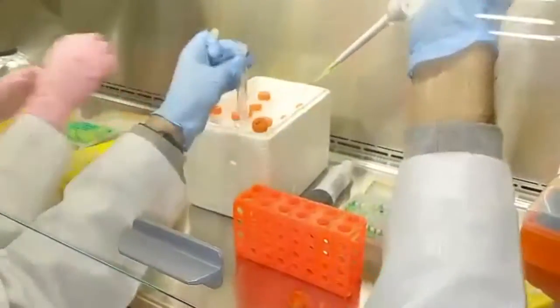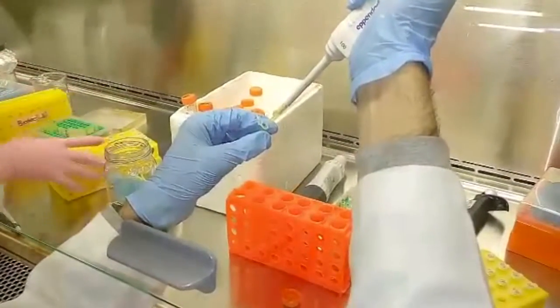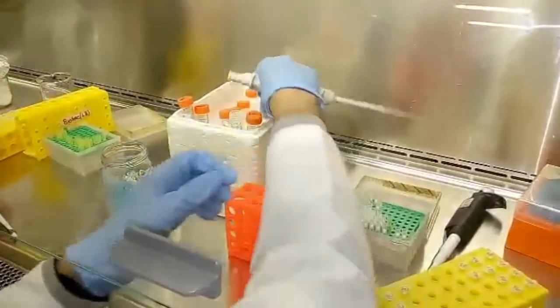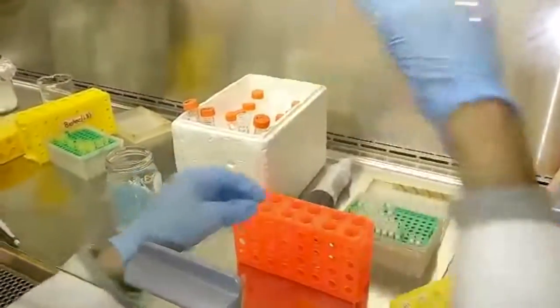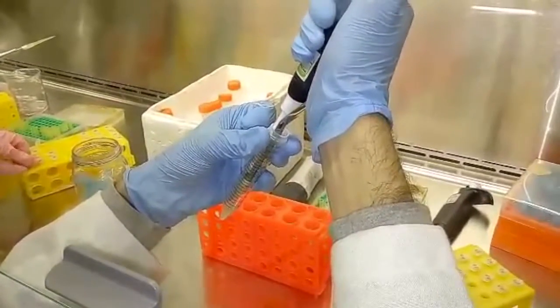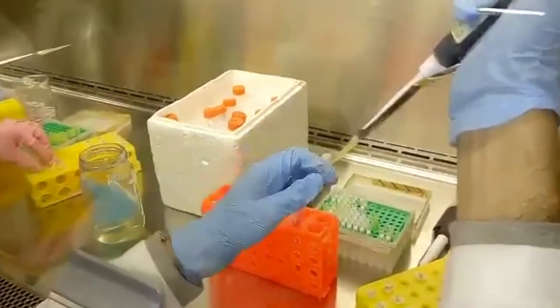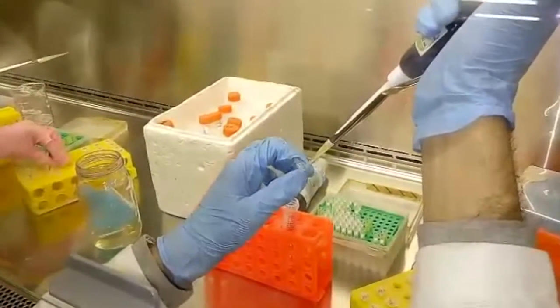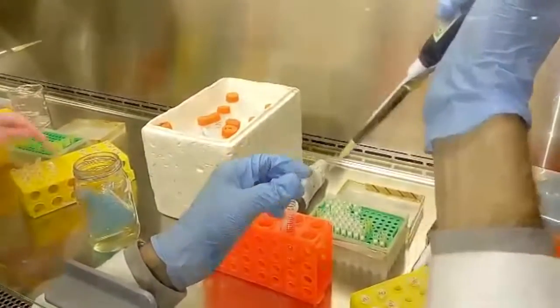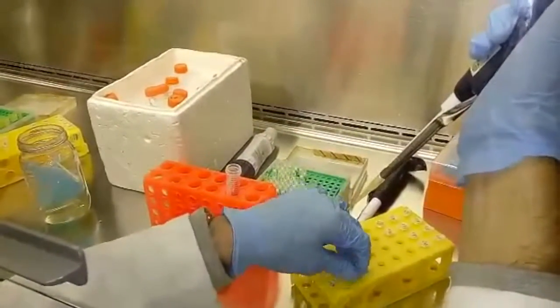If beta-galactosidase is produced, then X-gal is hydrolyzed to form 5-bromo-4-chloroindoxyl, which spontaneously dimerizes to produce an insoluble blue pigment called 5,5'-dibromo-4,4'-dichloroindigo. The colonies formed by non-recombinant cells therefore appear blue in color while the recombinant ones appear white. The desired recombinant colonies can be easily picked and cultured.